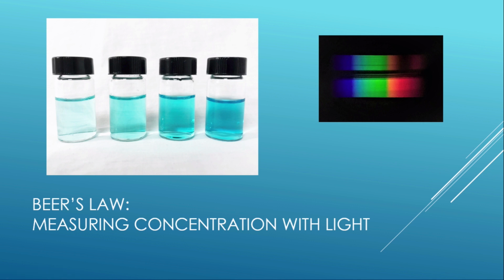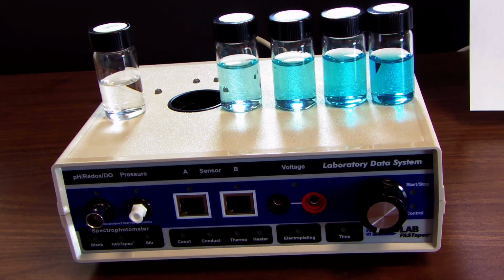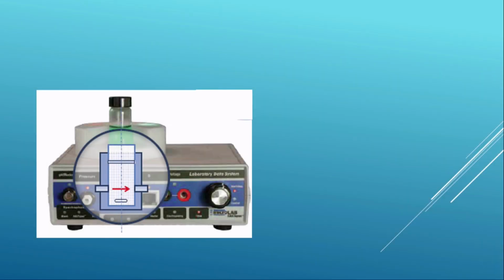Let's take a look at these samples sitting on top of the microLAB. We have these solutions sitting on top of the microLAB FS528. On the right are 4 solutions, and on the left is a blank, a distilled water sample. And I have here a graphic showing what is going on down inside of the spectrophotometer.